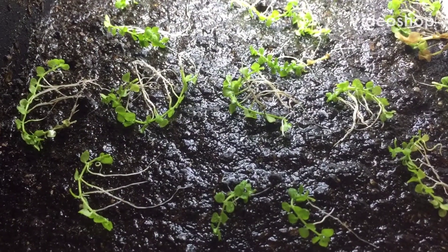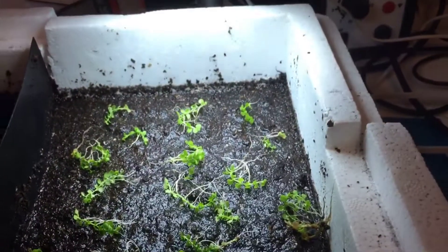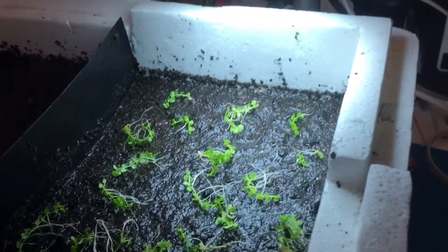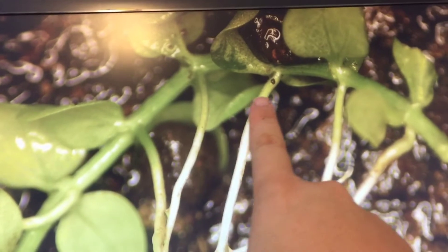In part two, I'm going to show you what it looks like under my microscope. I'm actually putting this under my microscope to show you how the Monte Carlo roots look. Let me use this — so this is a branch of the Monte Carlo.